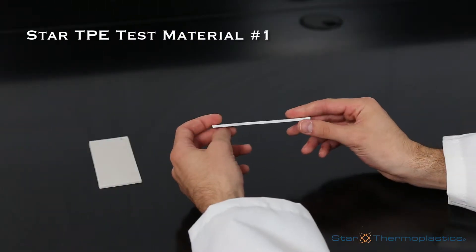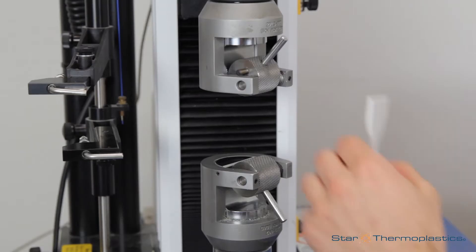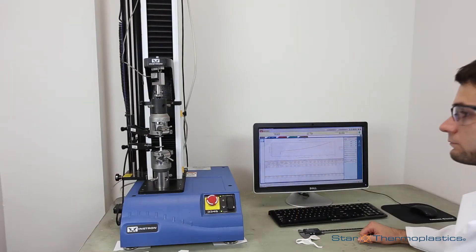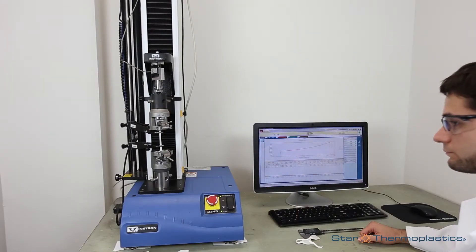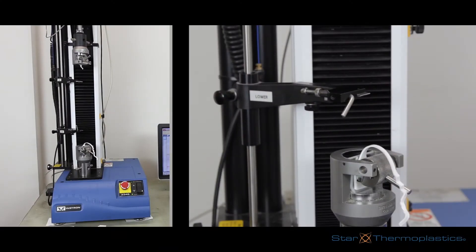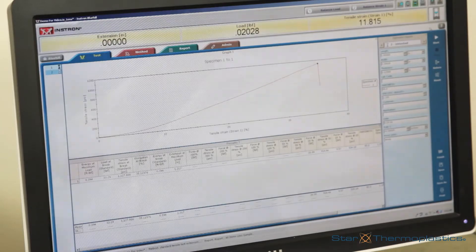The first material we have chosen to test is a Star TPE material with a very high tensile strength, such as what you would see in a strap to secure a bicycle to a car carrier. Wow, that was quite a stretch, and a very high tensile strength result as well.